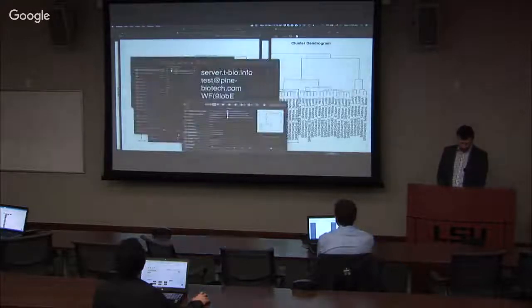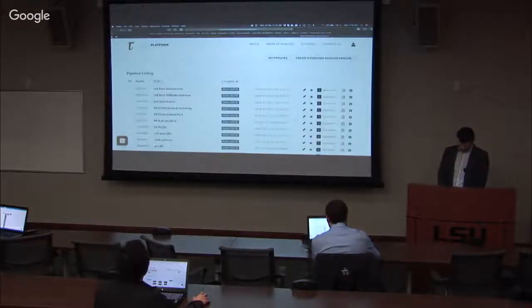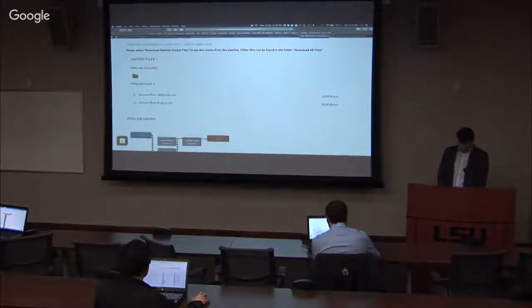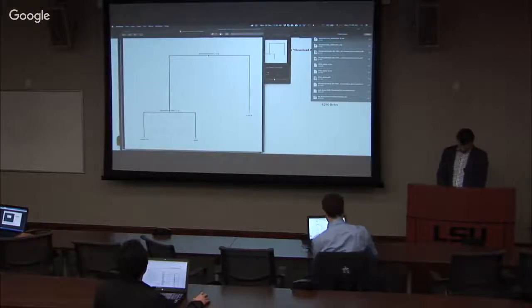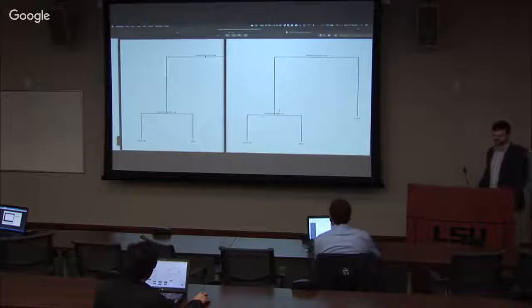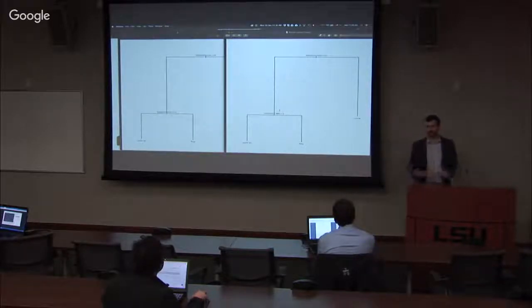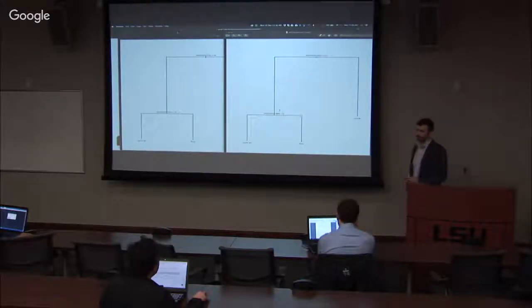Now let's take a look at the other result for the 15 genes. And this shows you really the problem of decision tree. The problem is that it will always find something. Most of the time it will find something. I mean, obviously, if it can't be separated, it's not going to find anything. But if you feed it something, it's going to come up with a result that best represents the difference between the classes. So the input is going to be very significant, right?